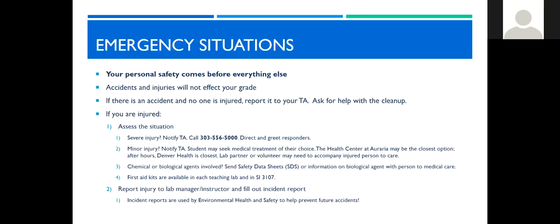If you need help with a spill, please ask for help. If you are injured, there are many different situations that can happen. If it's severe, of course notify your TA. Call the Auraria campus dispatch at 303-556-5000. Make sure you stay in the area to direct and greet responders if it's safe to do so. If you have a minor injury, notify your TA. You may seek the medical treatment of your choice. The health center at Auraria during normal business hours may be the closest option. After hours, Denver Health is the closest. Your lab partner or a volunteer from the lab must accompany you to your care.